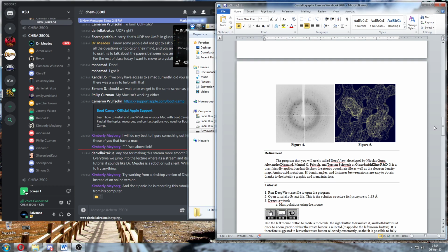And every electron in every molecule in every part of this crystal, which is compacted proteins, in this case all compacted into a small crystal, is going to interact with that X-ray beam. So what you see is X-rays being spread all over the place. So we get a detector like you did at the dentist's office, right? You put the screen behind your tooth and your tooth absorbed the X-rays and you get a shadow where the X-rays didn't make it through.